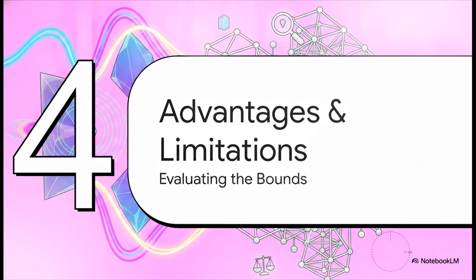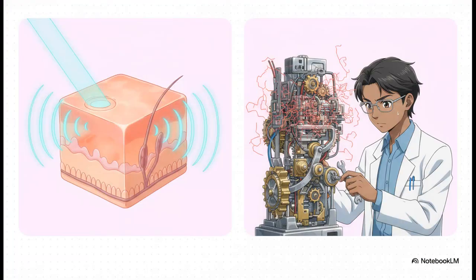Section 4. Advantages and limitations. Now, as with any advanced analytical technique, we need to be objective about its boundaries. The advantages, for sure, are staggering. You get exceptional ultra-trace sensitivity. You get high spatial resolution in deep tissues, and you achieve all of this non-destructively using safe, non-ionizing radiation. But there's always a catch, right?